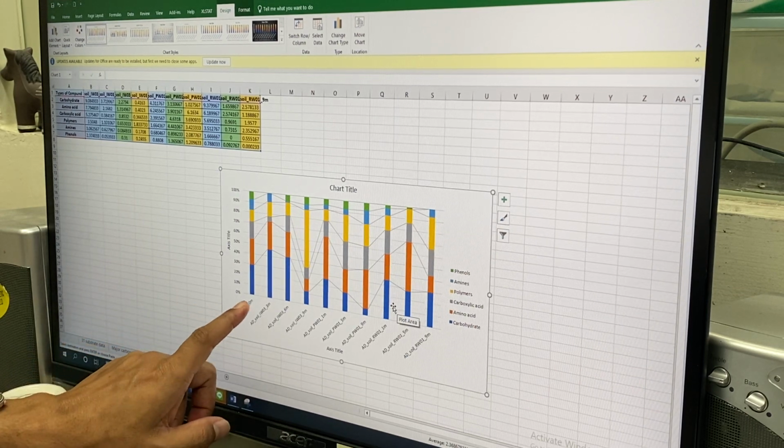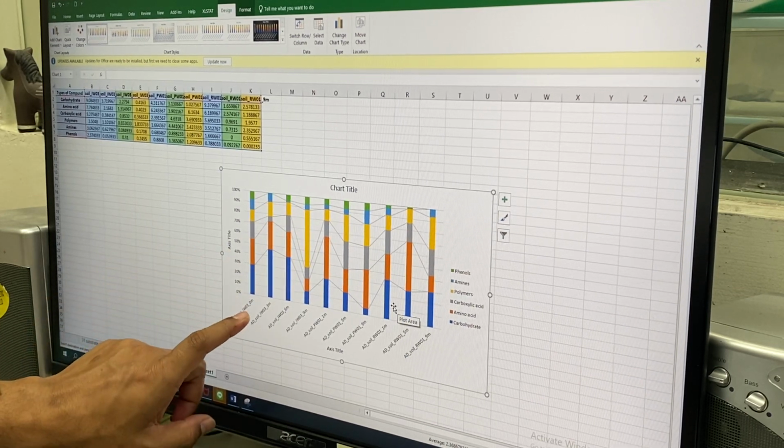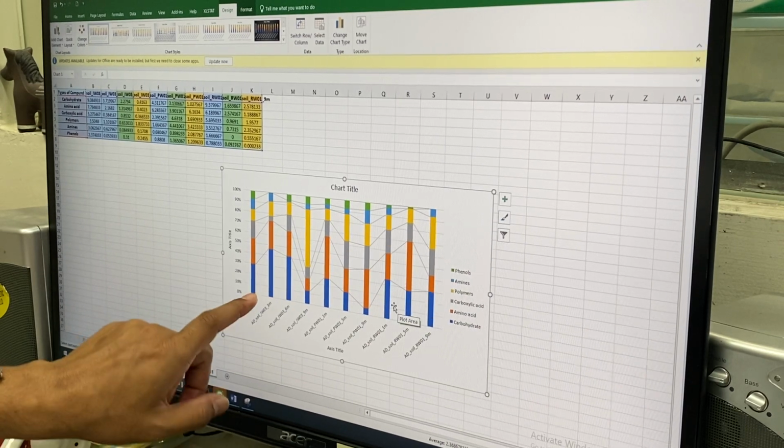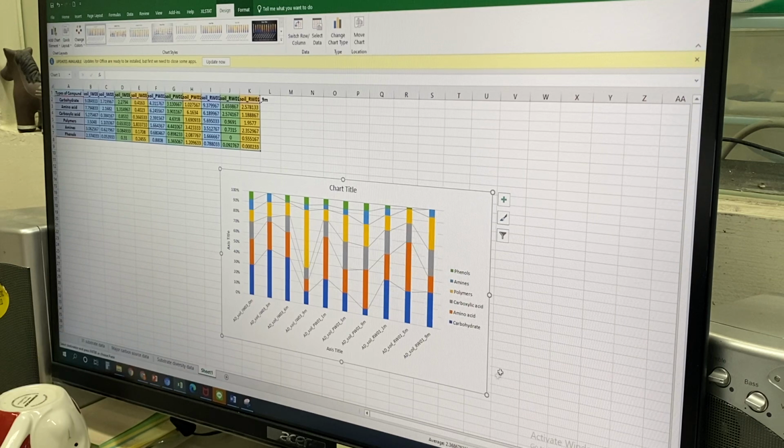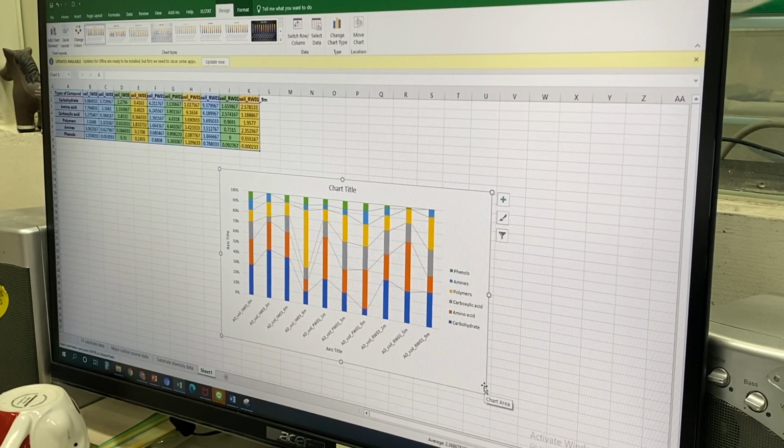So for the endpoint analysis, you can see the total for this sample. I think maybe when I finish the analysis, I will ask you how to explain this whole endpoint picture. I will do the analysis first, because if you tell me now how to explain this picture, I think I will forget it.